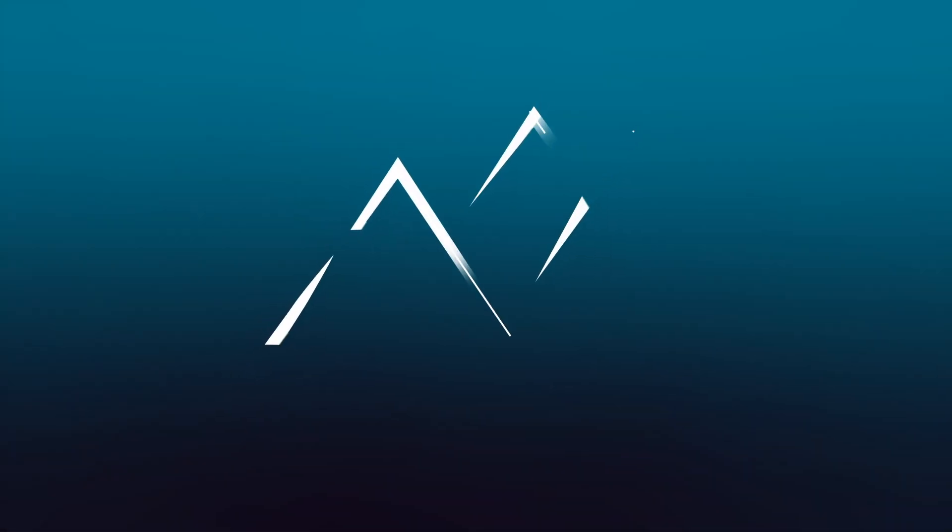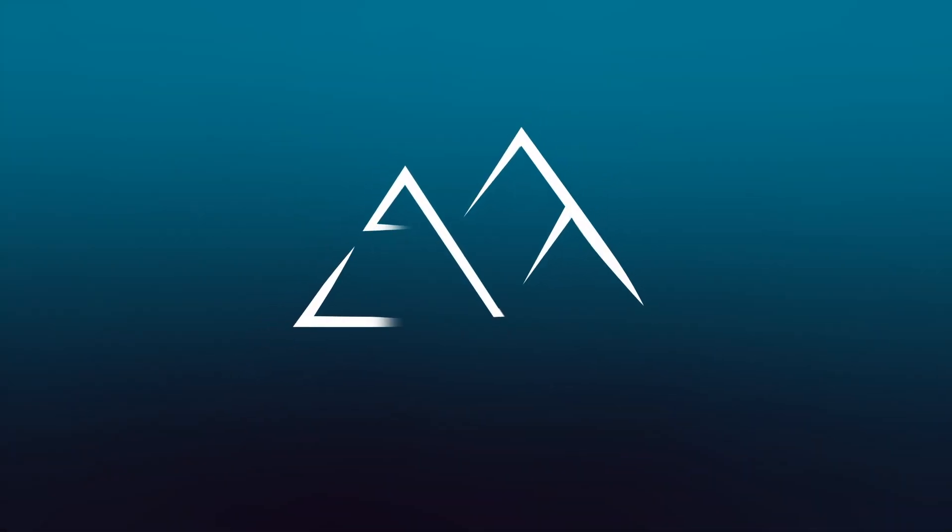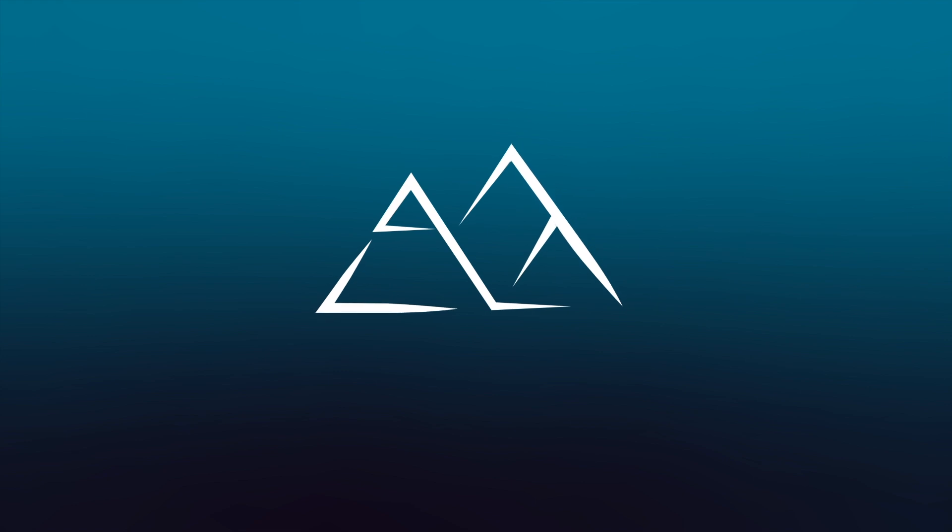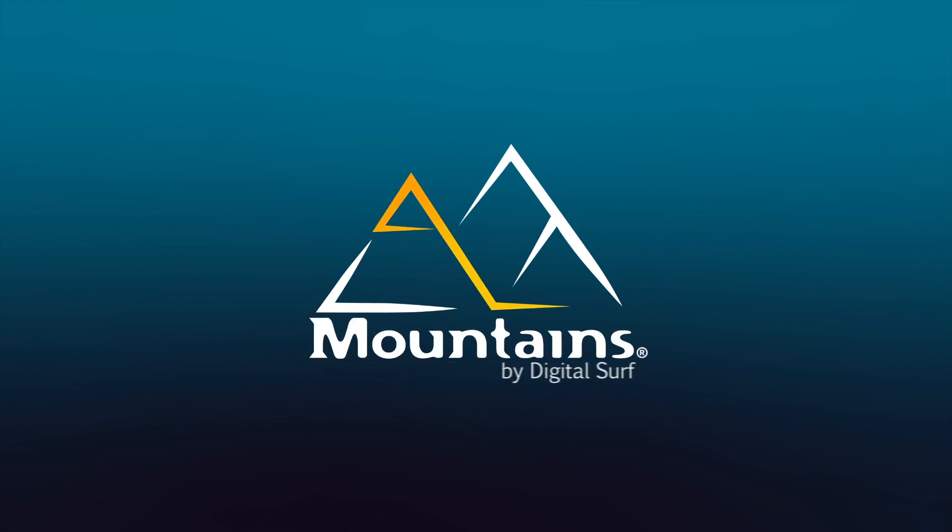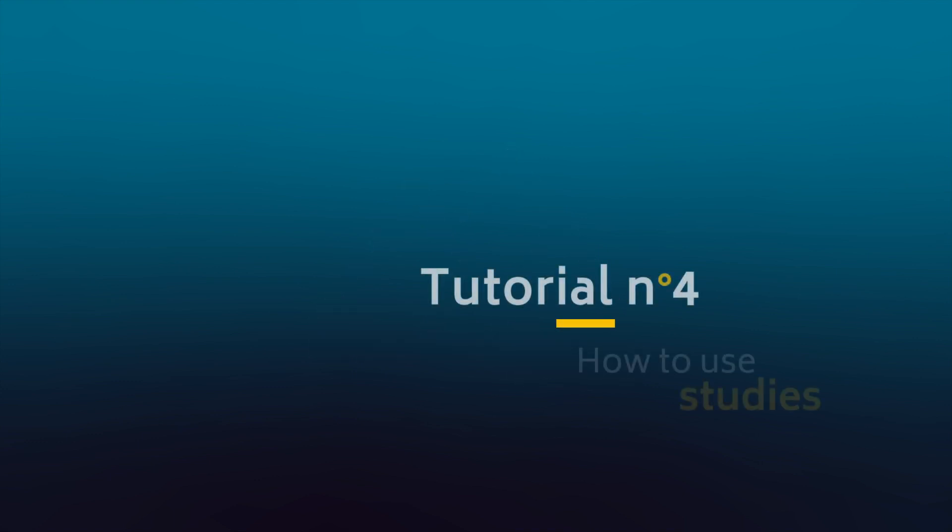Hello and welcome to the fourth video in this tutorial series on MOUNTAINS, DigitalSurf's industry standard software for profiler and microscope data analysis. In this video, I'm going to show you how studies work.